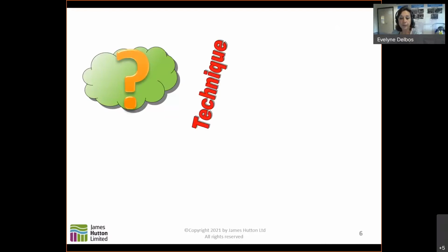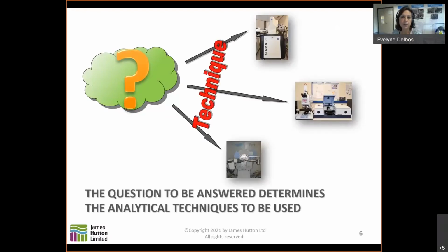We started our webinar one with asking a question. We wanted really to insist on the importance of being very clear about what you want to know about your material and the material that you send to us, because simply the question to be answered will determine the analytical technique or techniques to be used. In this case, we'll be focused, as Gareth said, on the electron microscopy, infrared, and XRD, X-ray diffraction.